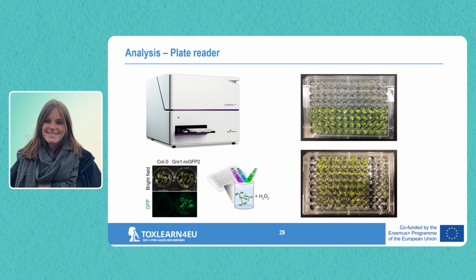And these are then the seedlings inside the plate reader. Here we have on the left side a wild type plant, so it doesn't have the sensor. And you see that when you check for the GFP signal, it's not fluorescent.